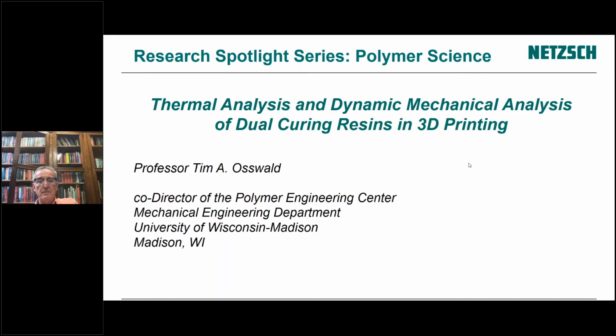Wonderful. That's all the, let me see, just scroll down here. Okay, we have a few more. I'll get to one more. Can the kinetic software convert the non-isothermal kinetics to isothermal kinetics?